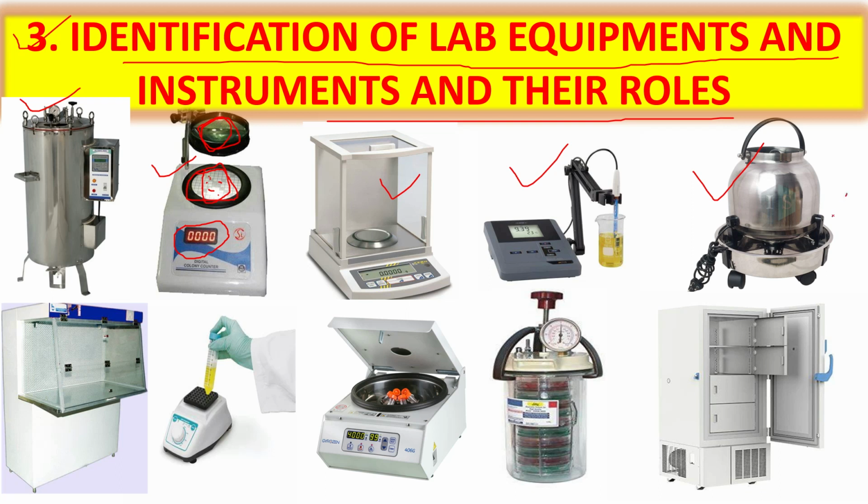So at first here we have to add the fumigating agents, and here a fan is present, so it circulates all the air or fumigating agents throughout the room, so that the room can be sterilized, okay, or free from any microorganisms. Okay, so move on to the next one, the laminar airflow or biosafety cabinets. So all these laminar airflow or biosafety cabinets are used to get a sterile environment, so you can perform an experiment under this sterile condition.